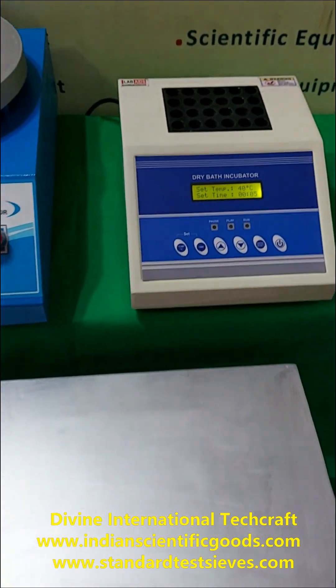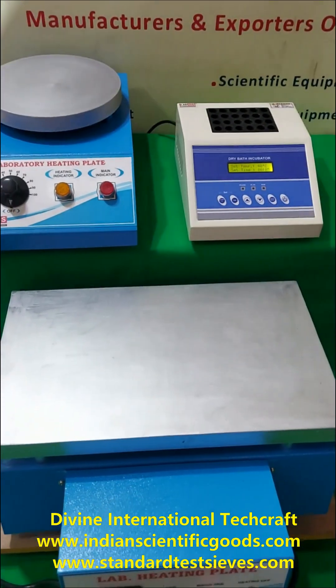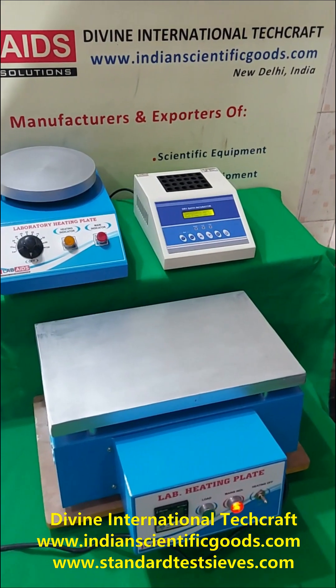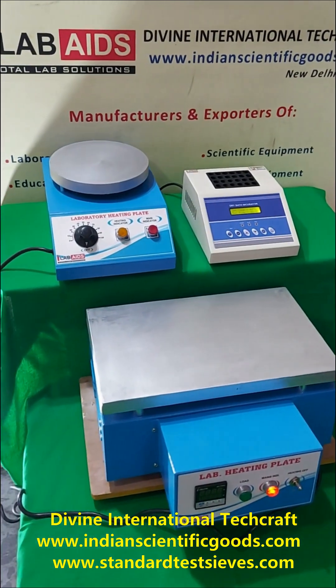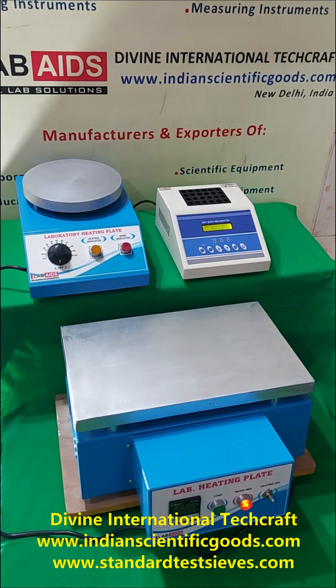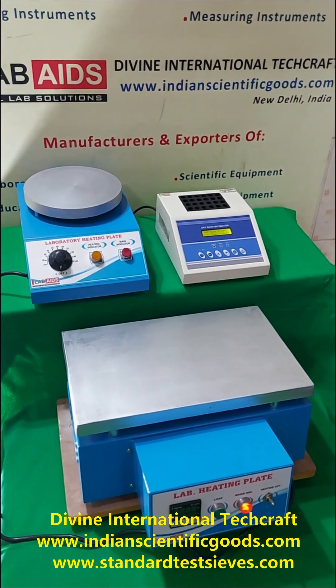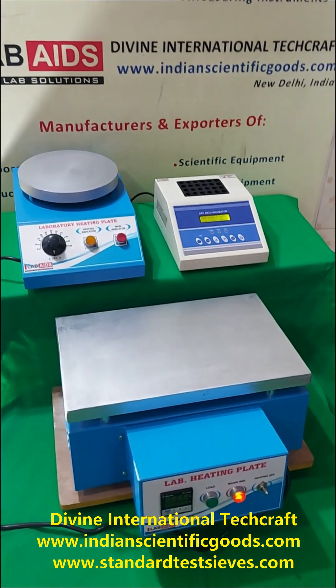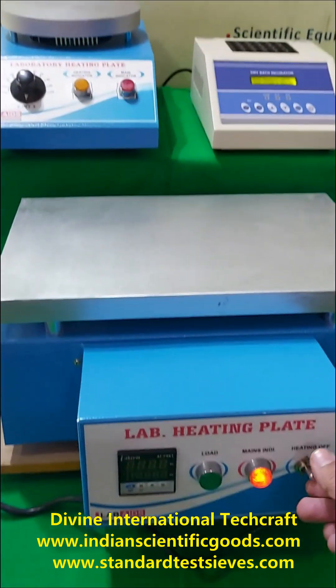All the hot plates and the block heater work on 220V AC 50Hz supply. We also provide hot plates with magnetic stirrers and we have a separate video demonstration for hot plates with magnetic stirrers. We wait for your enquiries and orders for these hot plates.